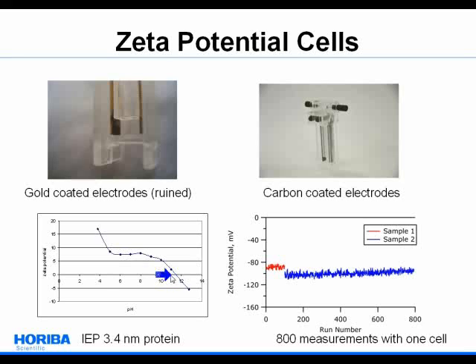And as I pass through the isoelectric point, I could actually see in the beaker the particles starting to aggregate, because as they're very small, they're not even visible. And as we pass through the isoelectric point, they became visible. One of the great unique things about the SC100 is when we first were designing this, we actually had gold electrodes. And when we were measuring biomolecules such as proteins, they started to discolor. What's happening here is because of Joule heating, we're actually kind of baking the sample onto the surface. And that's not good. Then you don't know if you should really trust that data.